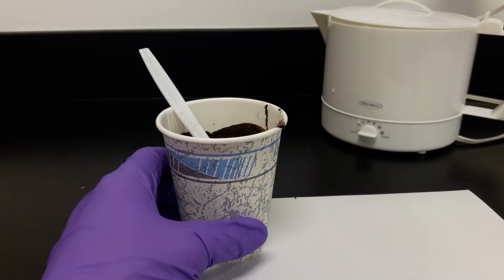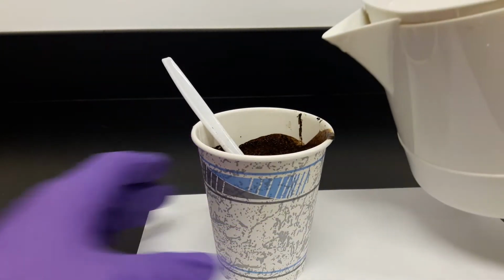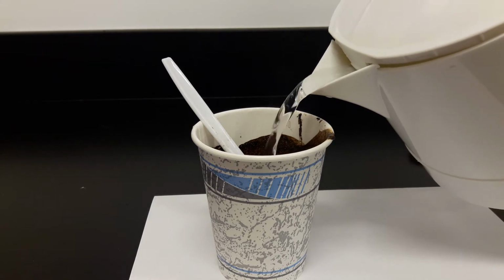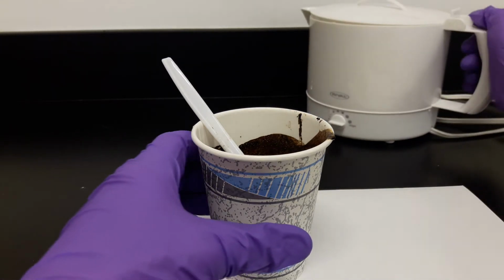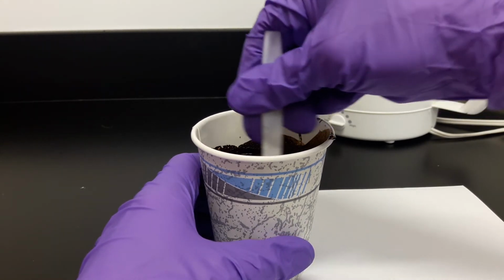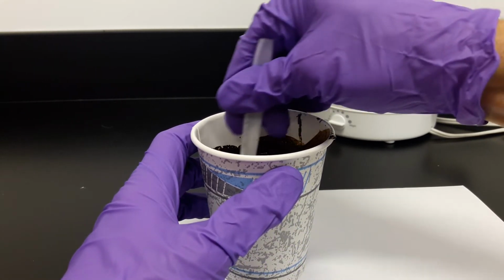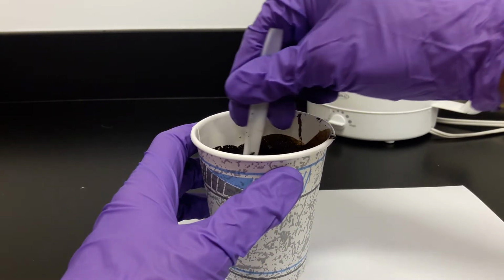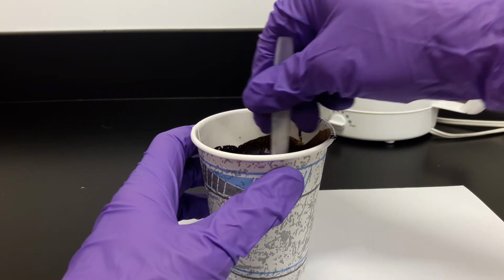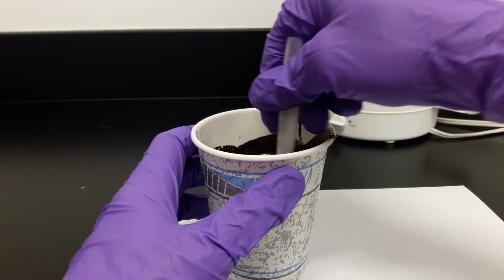Okay, our water is boiling again, so we're going to unplug the cord. We're going to pour some more hot water into the cup containing the remaining Athabasca oil sand, and we're going to proceed to clean again. Just like before, we're trying to break up any oil that's attached to the sand particles. We're going to stir this gently for a couple of minutes and then let the solution settle, and then pour the hot water and oil into the clean cup.